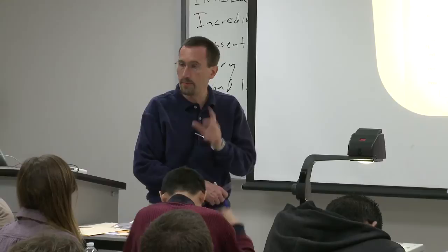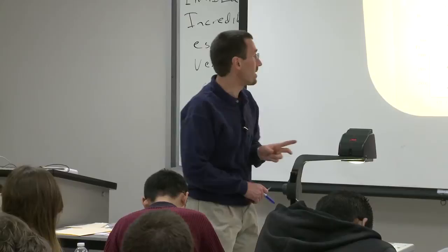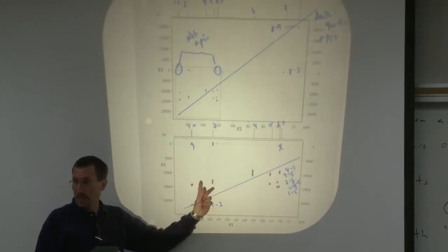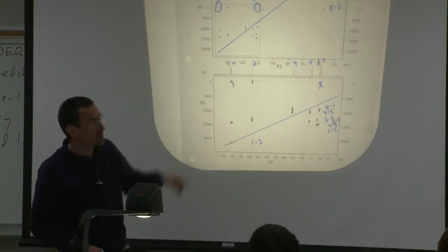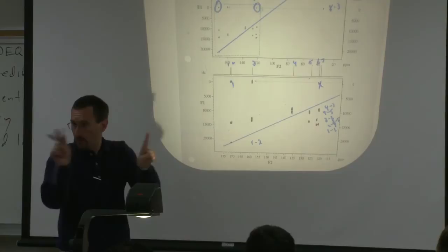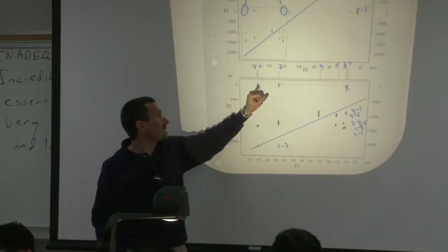So we have seen, in some cases, you can get some longer range coupling showing up. It's surprising. I wouldn't say never, but it would surprise me. Certainly, if you look at your little paired couplings, that's got to be an indication that it's one bond coupling. This molecule has a lot of sp2 carbons in it, as well as some sp3 carbons. If you had sp carbons, you could imagine even bigger spacing. That may be what we're observing here, some type of long range coupling. Honestly, I don't know. But you notice we're not seeing these paired lines here, so that's kind of an indication.